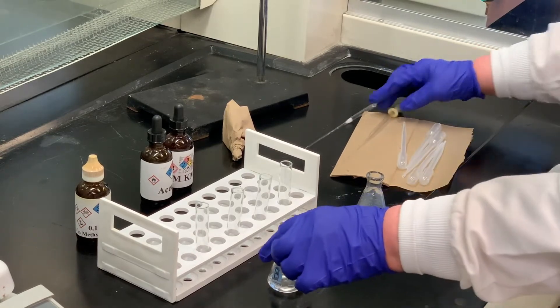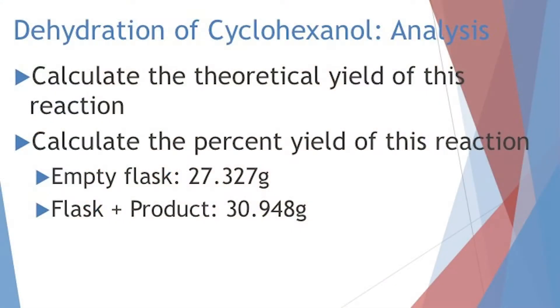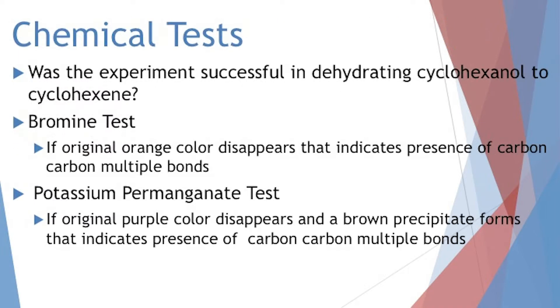All that's been transferred. I'm going to go weigh this and I'll be right back. The next thing we're going to do is take a look at some chemical tests. These tests will tell us whether we were successful in dehydrating cyclohexanol to form cyclohexene. We're going to use bromine and the potassium permanganate test. The bromine solution is an orange color — if we add a drop to our sample and that orange color disappears, that's evidence of a carbon-carbon double bond.